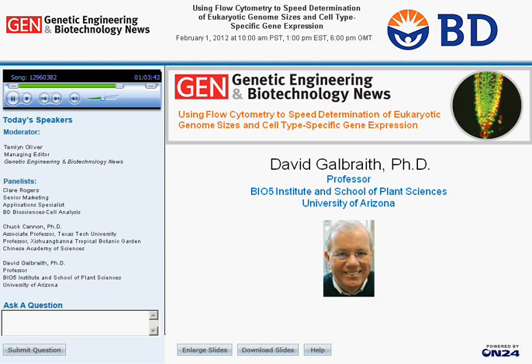Okay. The next question is actually a multi-part question, sort of two questions combined, so I'll ask a bunch of them. What types of DNA fluorochrome are recommended in plant genome sizing? Are there large differences between relative AT and GC content of these plant genomes? If so, is it important to use something like propidium iodide rather than AT base pair specific Hoechst 33342?